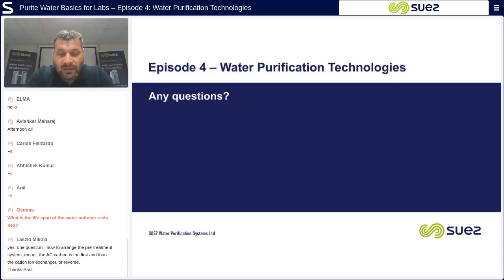Hi, Laszlo. Generally, the way that we build our systems, we will have the water softener first and the AC carbon afterwards. The reason being is we try to keep the chlorine in the water for as long as we can to reduce the bacteria, because obviously the chlorine will kill any bacteria in the water. So we keep the chlorine in to reduce the bacteria count before it gets to the RO unit. So we typically have the water softener first and the AC carbon afterwards.